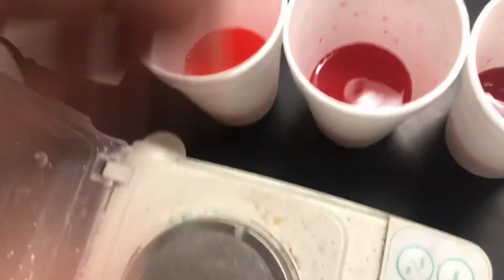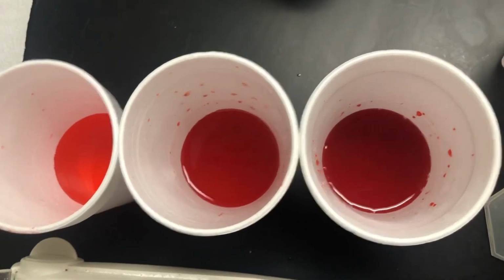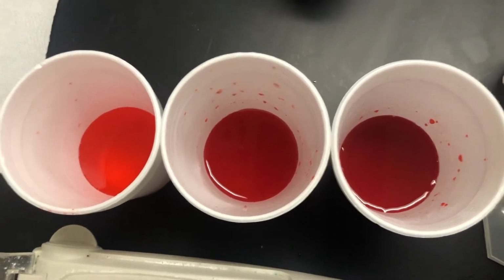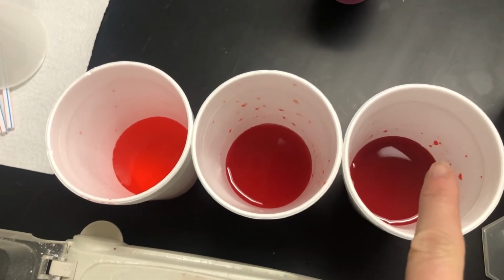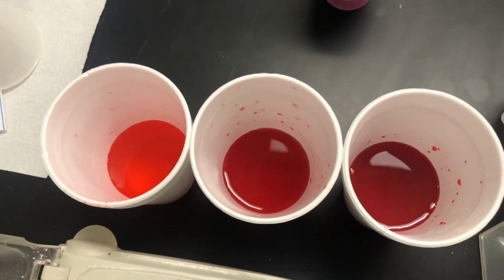There it is. So looking at them all side by side, can you tell the difference? You should be able to. Which one's dilute? Winner, winner, chicken dinner. Which one's the most concentrated? This guy. Not strong. This isn't strong and weak. This is concentrated and dilute.